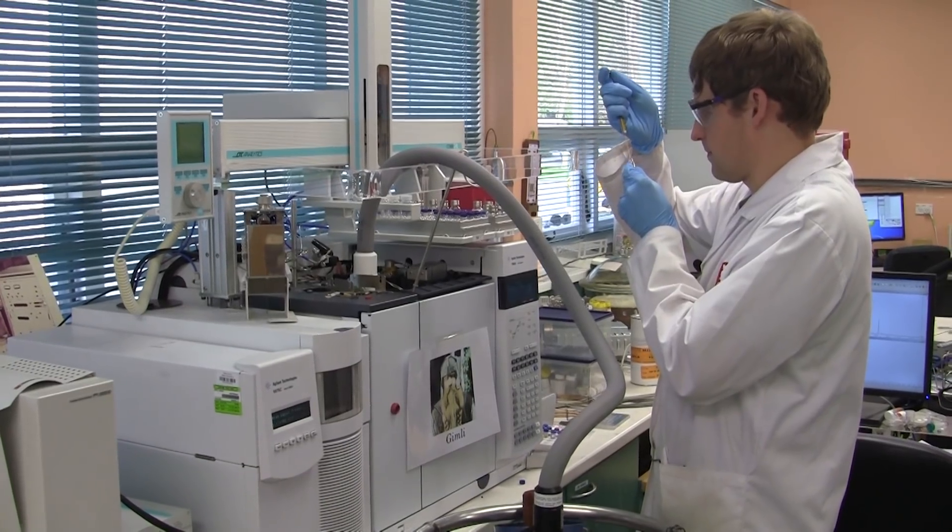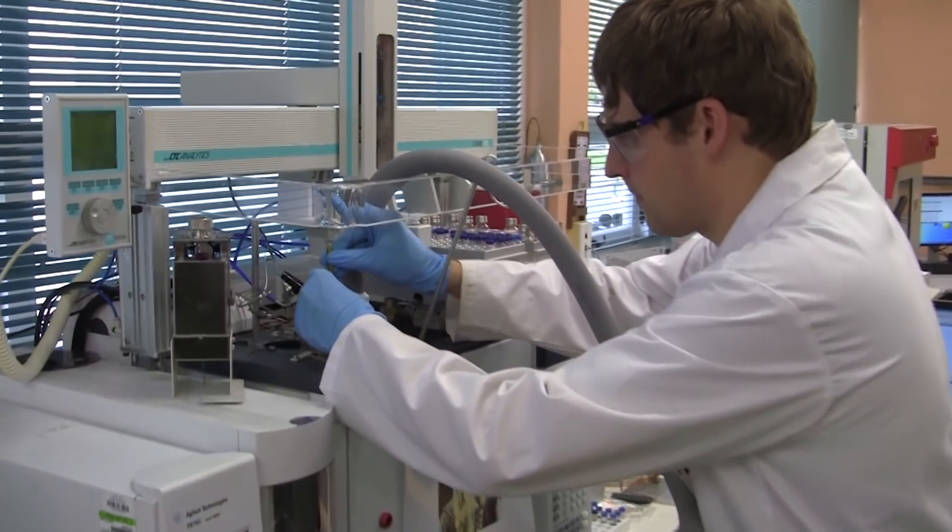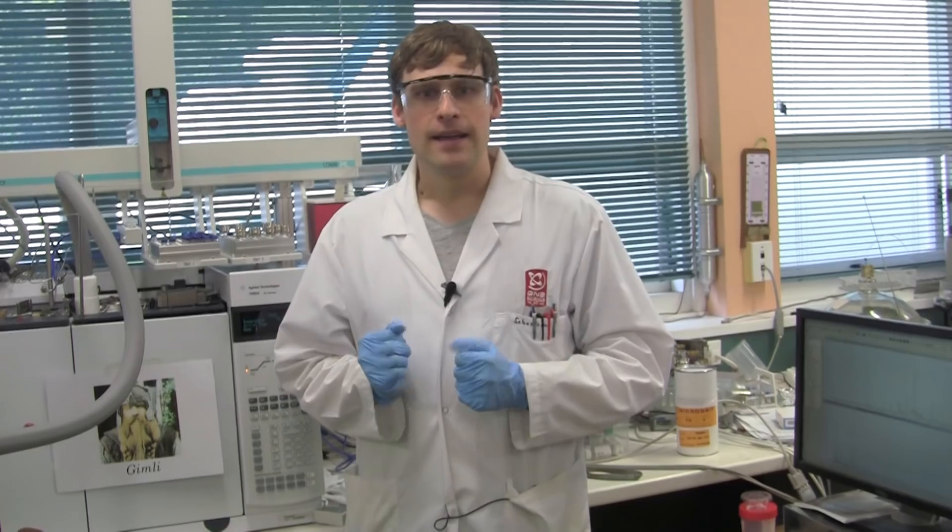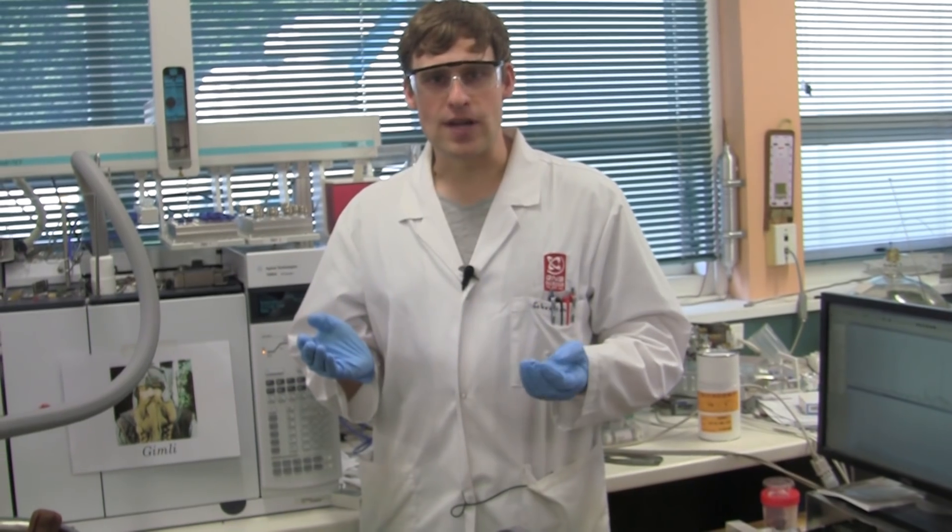This instrument gives us so much more than what we can just do visually as we've seen before in the lab. So this is our method of choice. It gives us so much insight into our environment to learn more about pollution of our lakes, to learn about climate warming, about environmental and climate change.